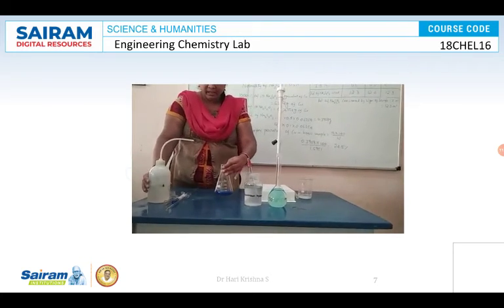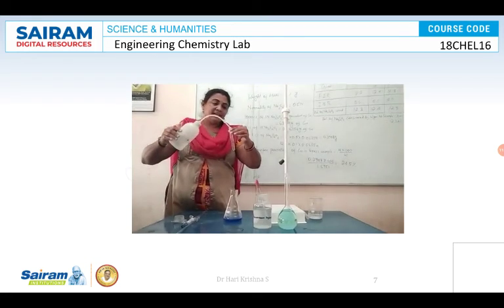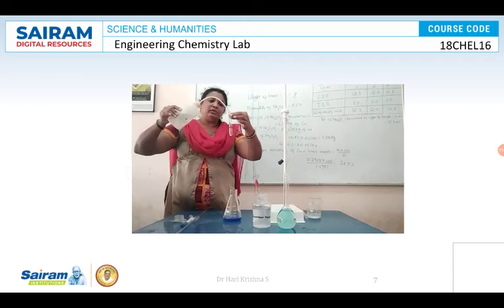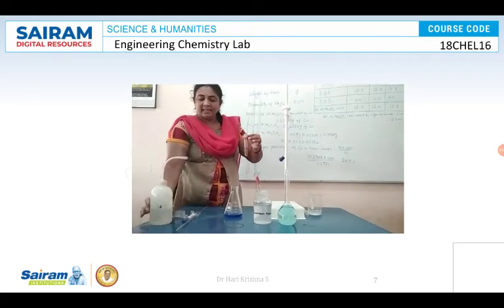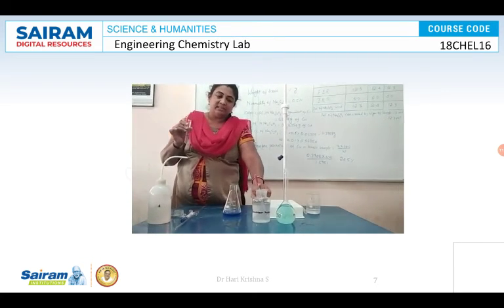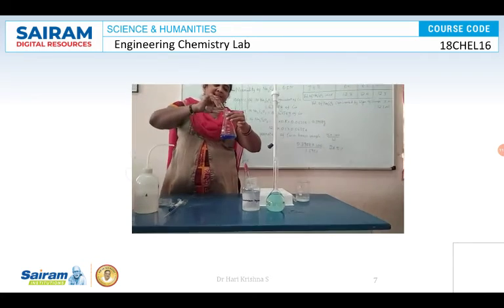Now what is the next step? We have to add 1 test tube of dilute acetic acid. And why are we adding this dilute acetic acid? Dilute acetic acid is added to remove the excess of the ammonia added and to provide slightly acidic medium.